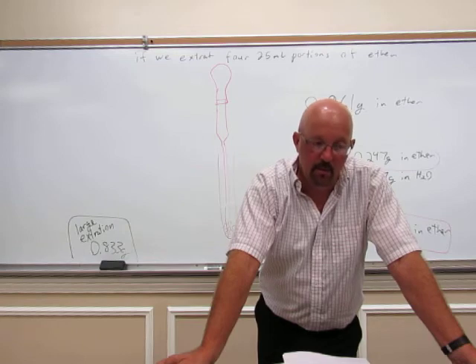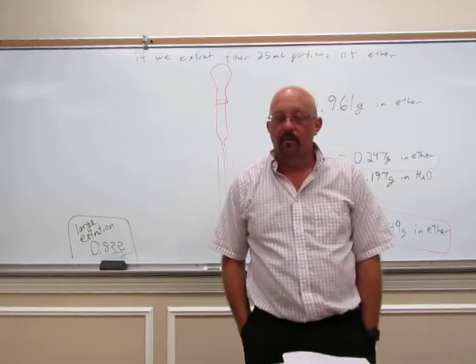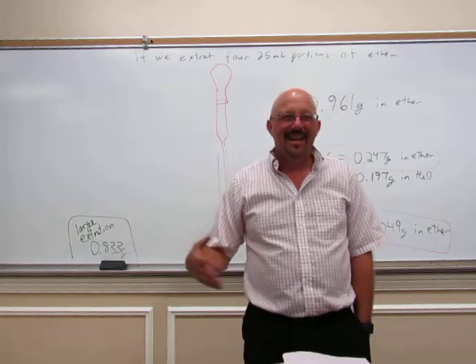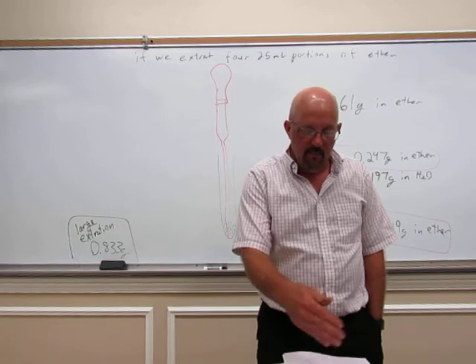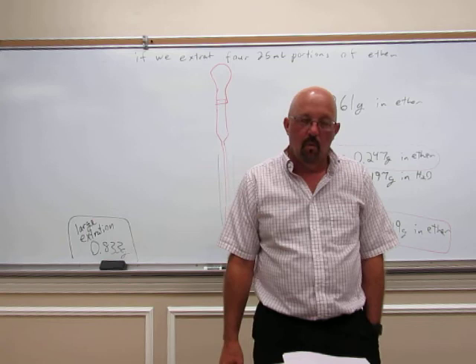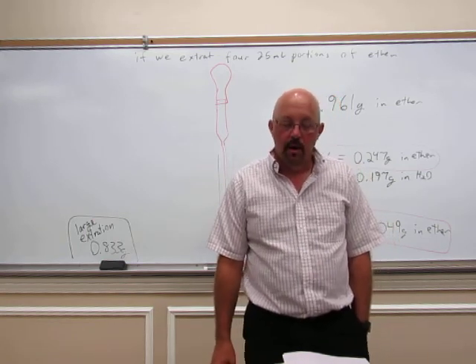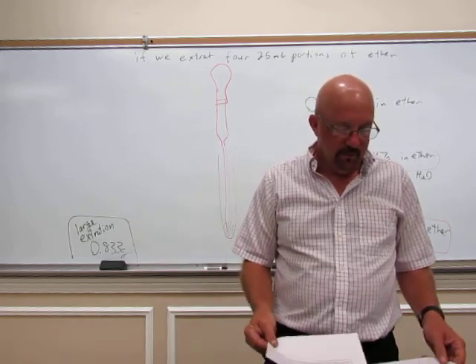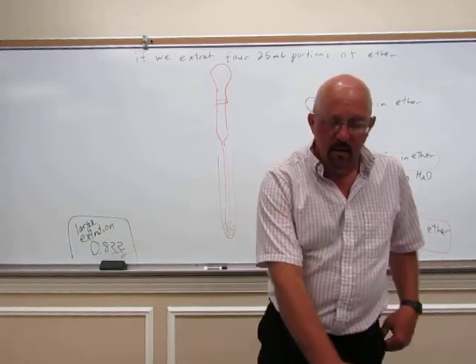So that's the amount that's in the dichloromethane. You know how much you started with. You started with 100 milligrams, and let's say we extracted 90 milligrams, then the remaining 10 milligrams was in the water layer. So you can subtract however much you had there from the initial amount, and that's the amount that's still in the water. And so then you can plug your numbers into the equation there and calculate the distribution coefficient or partition coefficient, whichever you prefer to call it. Okay, so that is the theory behind this week's lab.